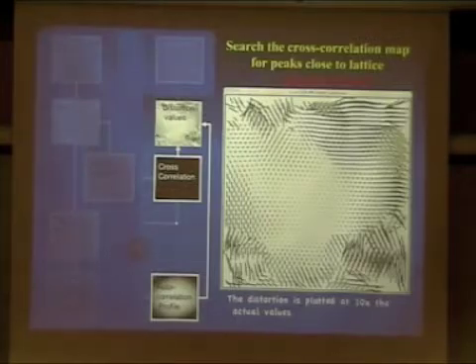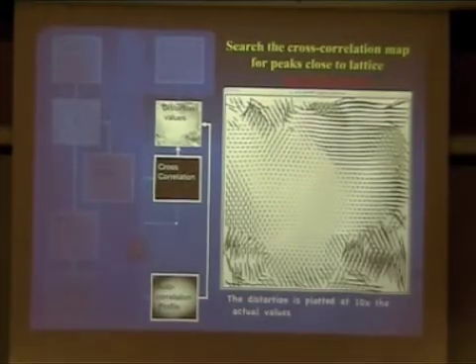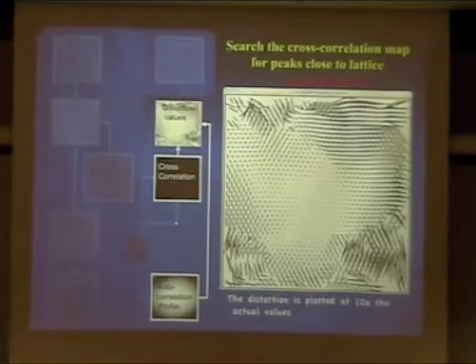Okay, just one question on your remark before. So you determine the position for your search not from the central position, but relative to nearby positions in the search. Okay, yeah, and then you reveal the problem: a half lattice constant shift will not be found. That's unfortunate.